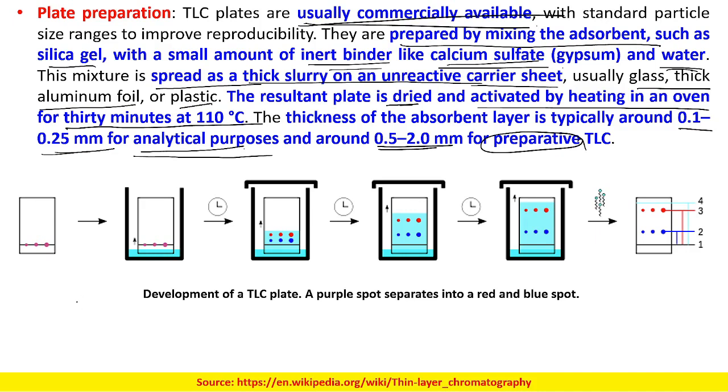Okay, now you have the plates, you have activated the plates, you put in your mixture samples, then you put it into the solvent, then see this is the solvent front, it is moving, and while it is moving, the analytes within the samples are getting separated. Okay, and after you have done this, we can see from here that we are having two analytes in all the three samples.